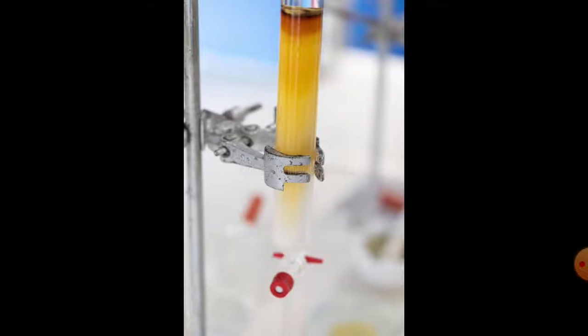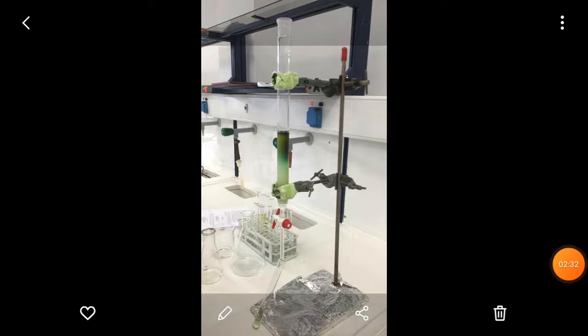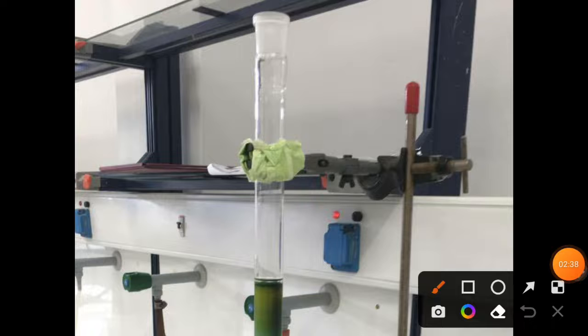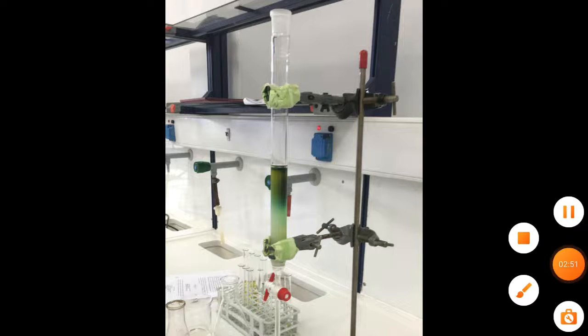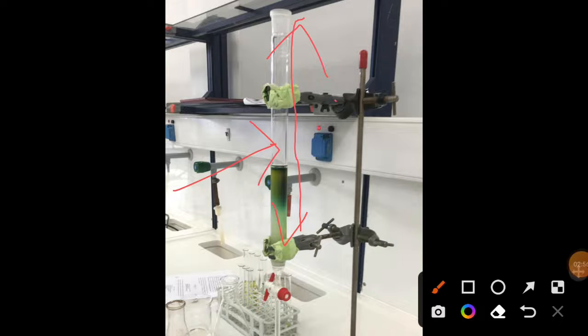So now today's topic, that is column chromatography. Column chromatography helps us to separate larger samples fast, and this can be done with the help of this column. The first thing that we need to know is that our first goal in column chromatography will be to prepare or package the column. In the column there will be our solid phase, and we will prepare our mobile phase, the solution containing the sample, right?